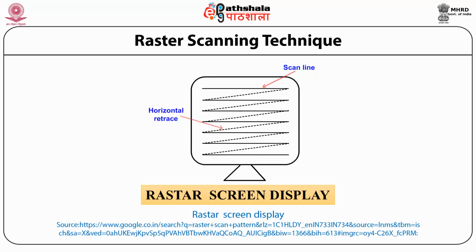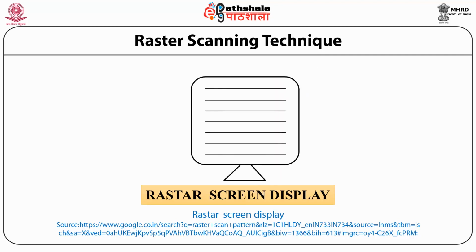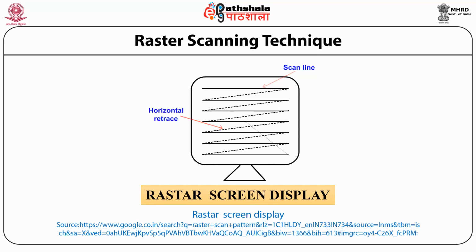The pattern left by the lines of a rake when drawn straight resembles the parallel lines of a raster. This line by line scanning is what creates a raster. It is a systematic process of covering the area progressively, one line at a time.